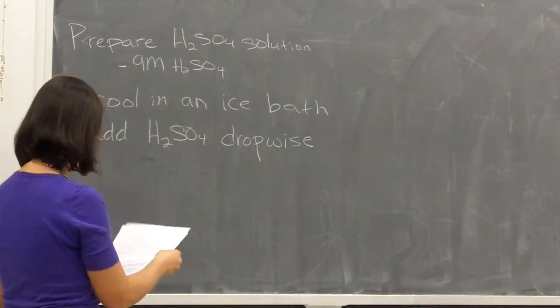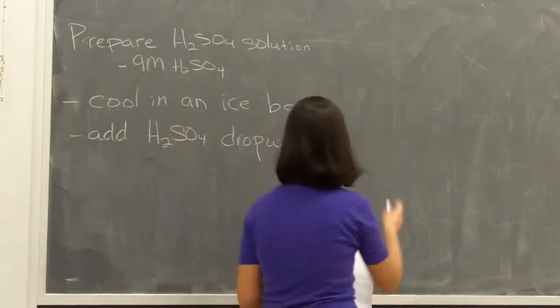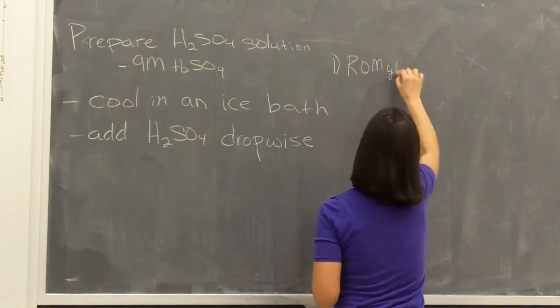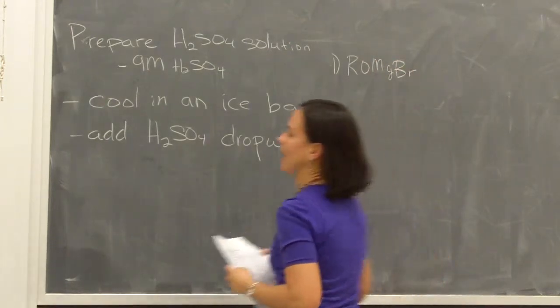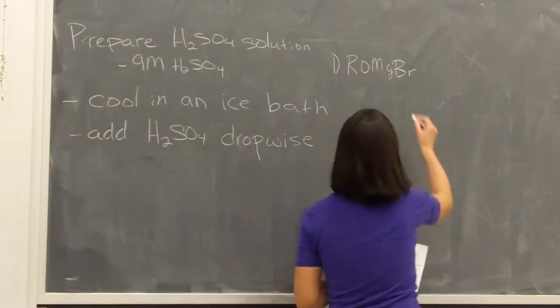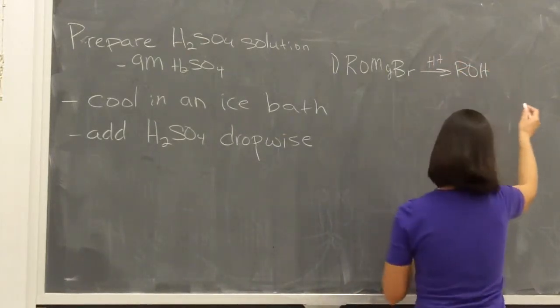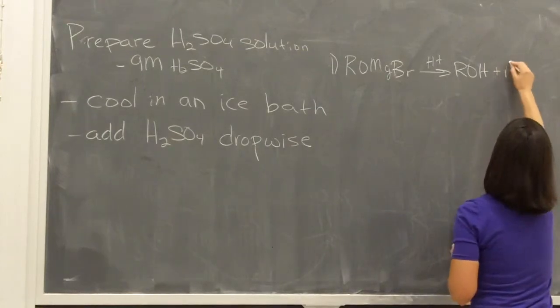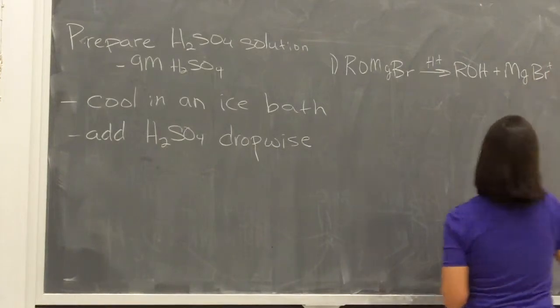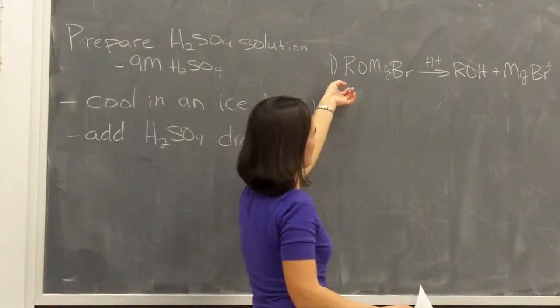So there are some reactions that are taking place during this quench. First of all, what we want to have happen is we have our species from our Grignard synthesis. So we want this converted to the alcohol. So we've got that going on. Alcohol is formed. As we make this MgBr plus, that plus will eventually end up quenched. But here's where we're making our alcohol.